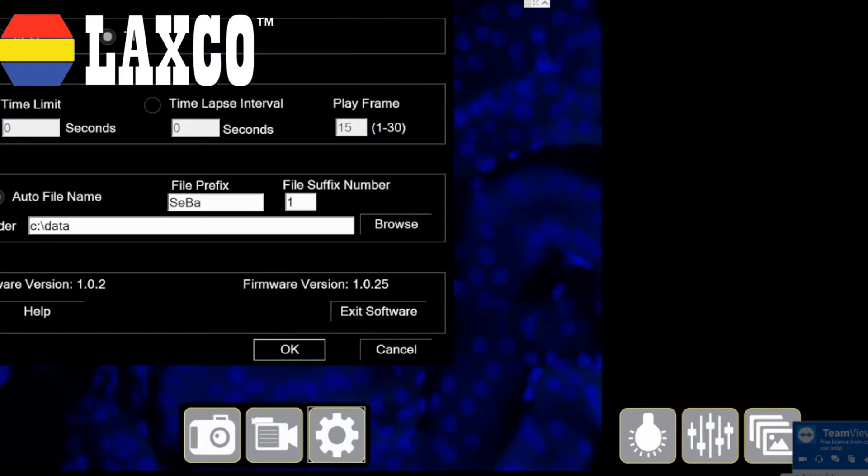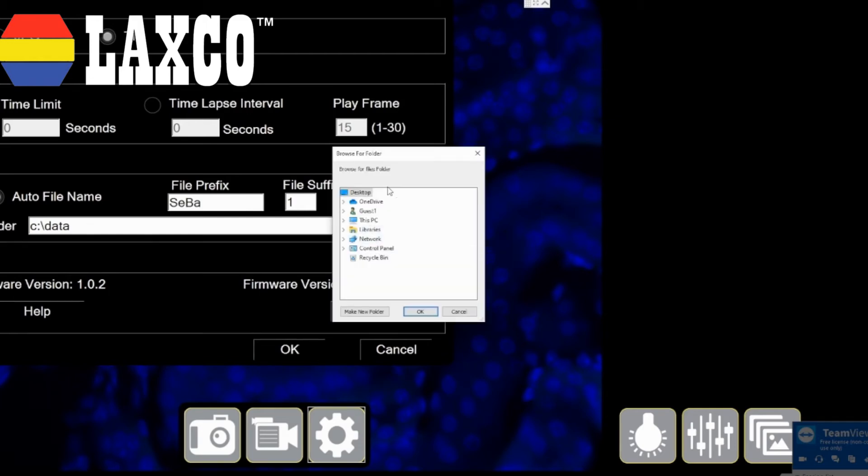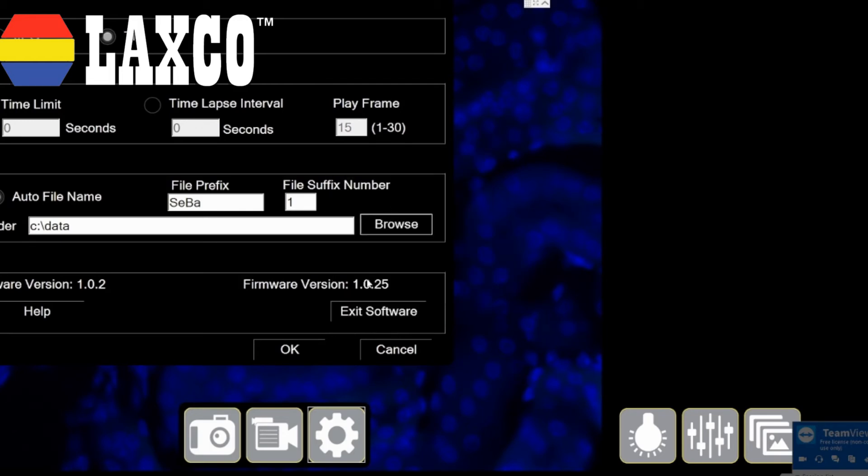I have my settings button here. It gives me the flexibility to choose the image format I need. I can take high-res images or lower-res images depending on my application. If I need images for publication, I would choose TIFF. This is my time-lapse imaging box. I can choose to define the time limit, the time-lapse intervals, and the frame rate for all my video recordings depending on my application and experiments. I also have a location selector where I can pre-assign the location on my computer where I want to record my data.